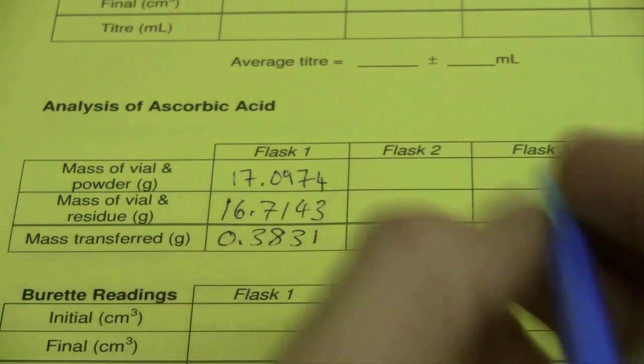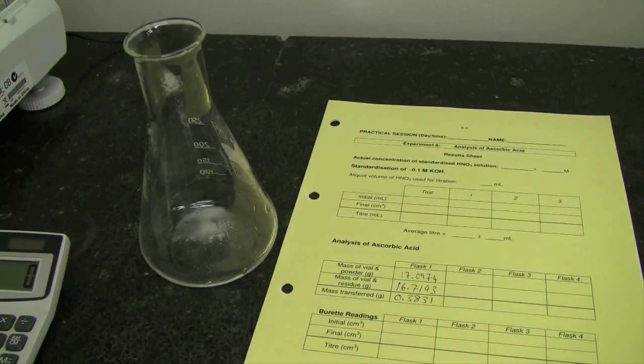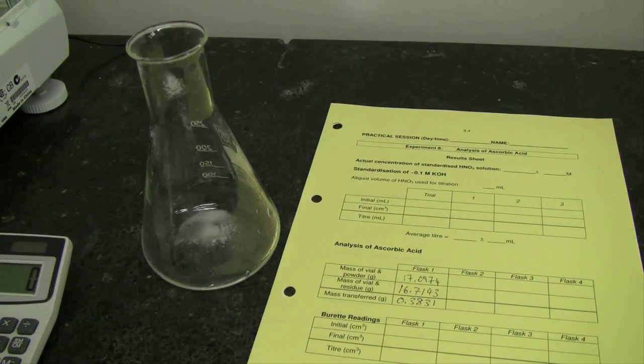Repeat this procedure several times so that you have four accurately known masses of ascorbic acid in four separate conical flasks. Make sure you know which mass is in which conical flask.